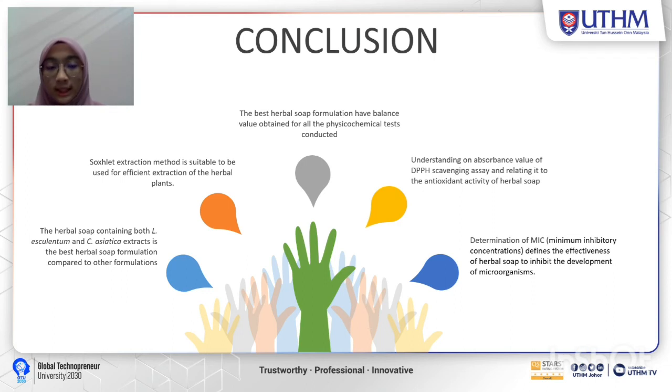Next, the Soxhlet extraction method is supposed to be suitable to be used for efficient extraction of the herbal plants. This is because there are previous researches that have successfully conducted this method on other herbal plants. The third conclusion is that the best herbal formulation should have balanced values obtained for all of the physicochemical tests conducted.